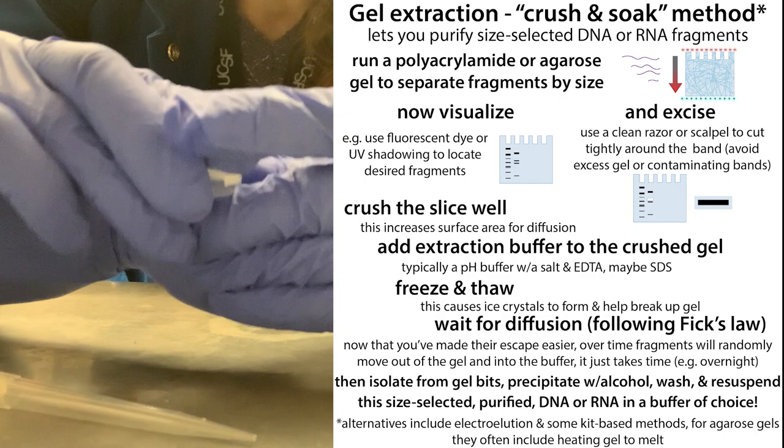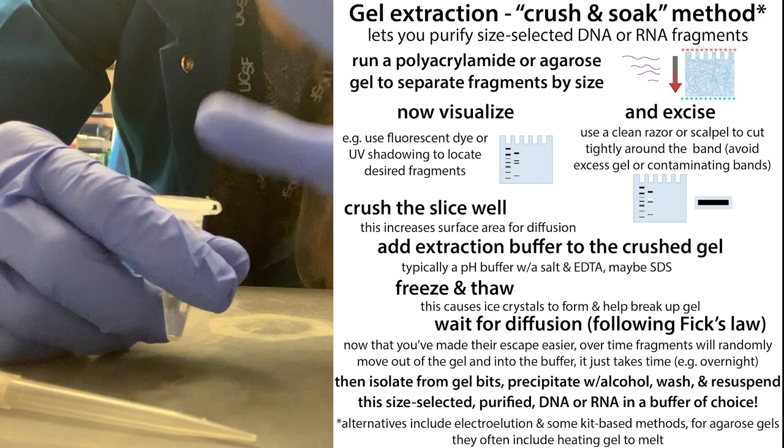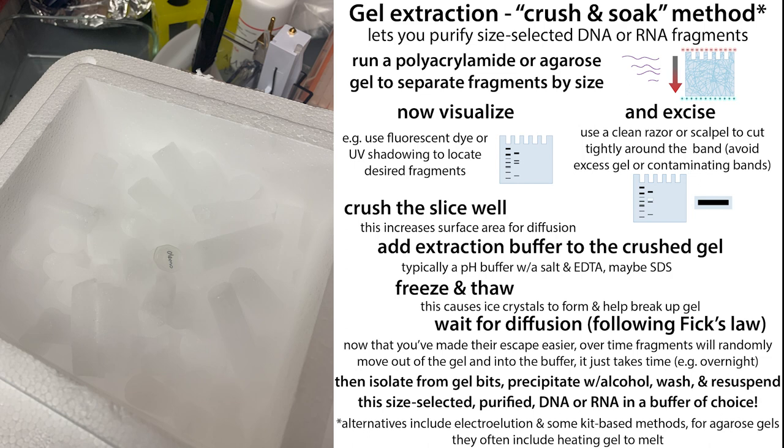Cap your tube and invert it to make sure you get everything off the walls. Give it a quick pulse spin in the microcentrifuge to get everything off the cap before you freeze it. Then place it on dry ice for about 30 minutes. If you have a meeting, you can leave it on dry ice during that. If you don't have 30 minutes, just put it in the minus 80 freezer and deal with it later.